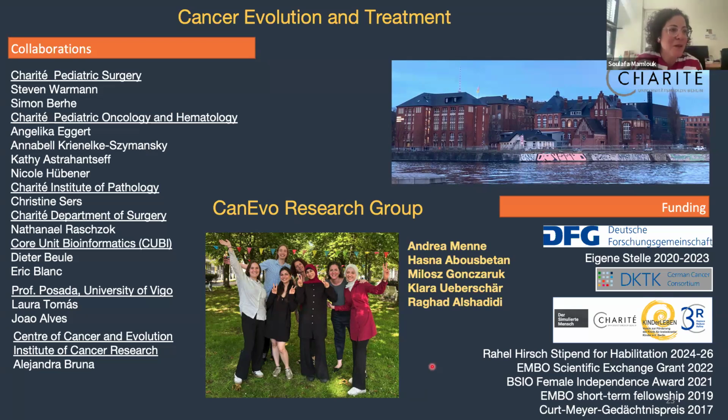Yeah. So when I show organoids in almost any talk, I always get the question of, but you're just looking at tumor cells, the microenvironment is so important. Of course, and when I'm in a bad mood, I say, well, it's better than cell lines. I think it's like degrees, right? A lot of work is still being done on 2D cell lines that grow on plastic for 30, 50 years. So we've moved forward. Also, when we make these organoids, they come from that patient, right? So it's not a mouse model. We're really that close.